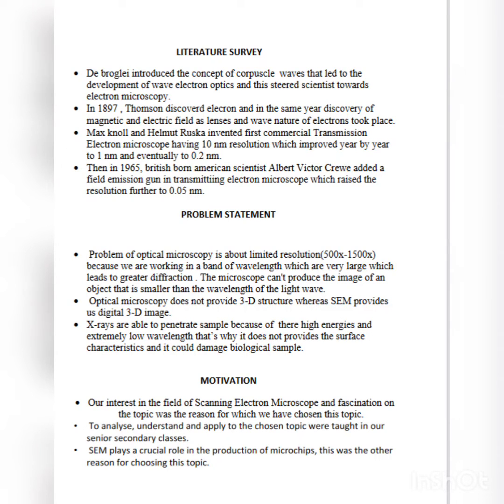Now, motivation. Why did we choose the scanning electron microscope as our topic? Our interest in the field of scanning electron microscope and fascination with the topic was the reason for which we have chosen this topic, to understand, analyze and apply the topics which were taught in our senior secondary classes. SEM plays a crucial role in the production of microchips, and this was the other reason for choosing this topic, as India is holding a very high position in electronics and microchip design nowadays.